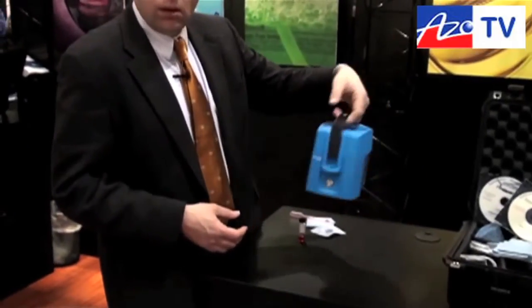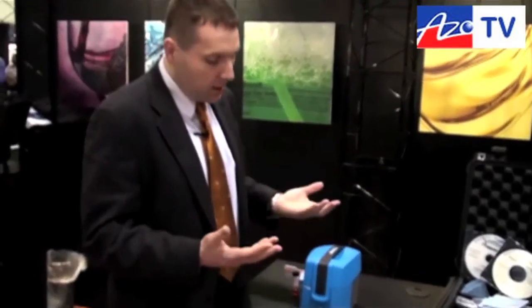That's all there is to it. You use this for hydraulic fluids, turbine fluids, engine oils, and you'll get viscosity at 40 degrees C — straightforward and quick to run. When you're finished, just fold it down and bring it anywhere you need. That's all there is to it.